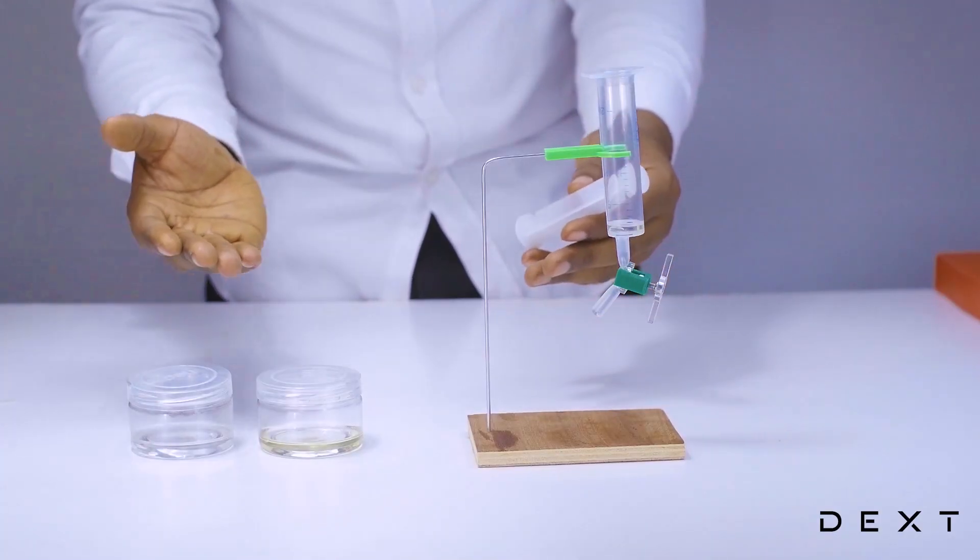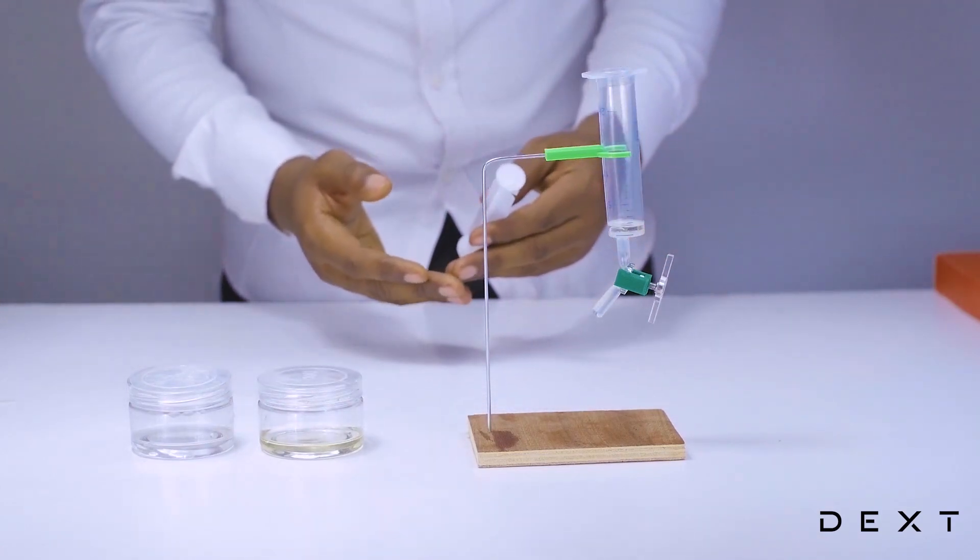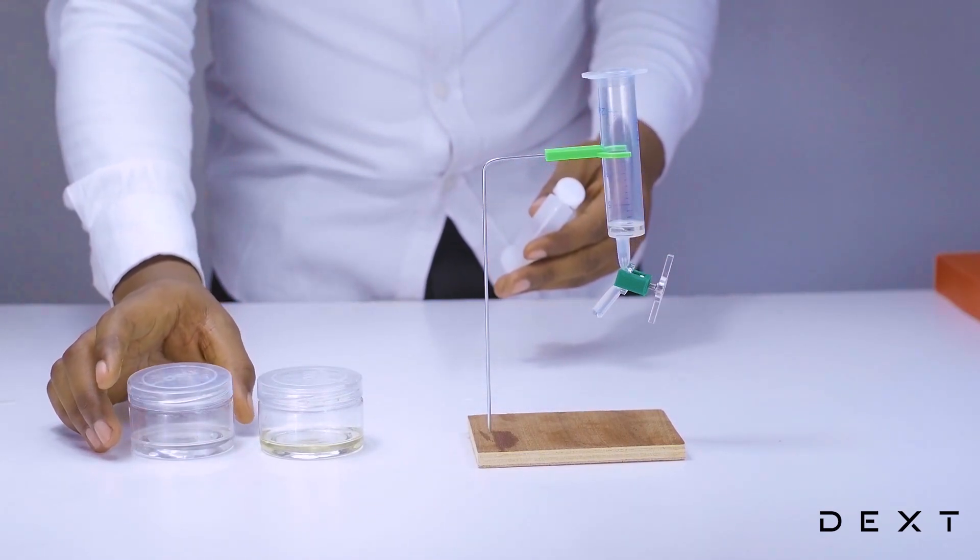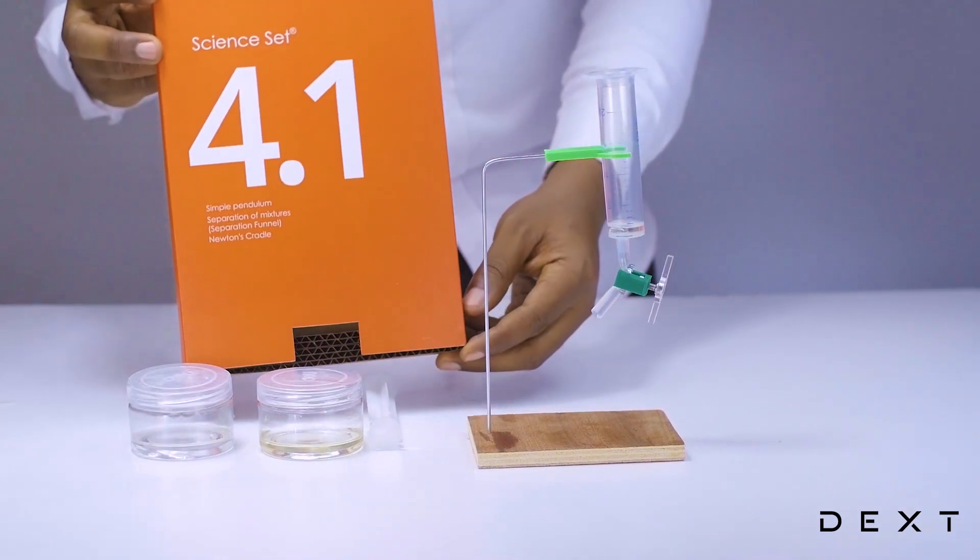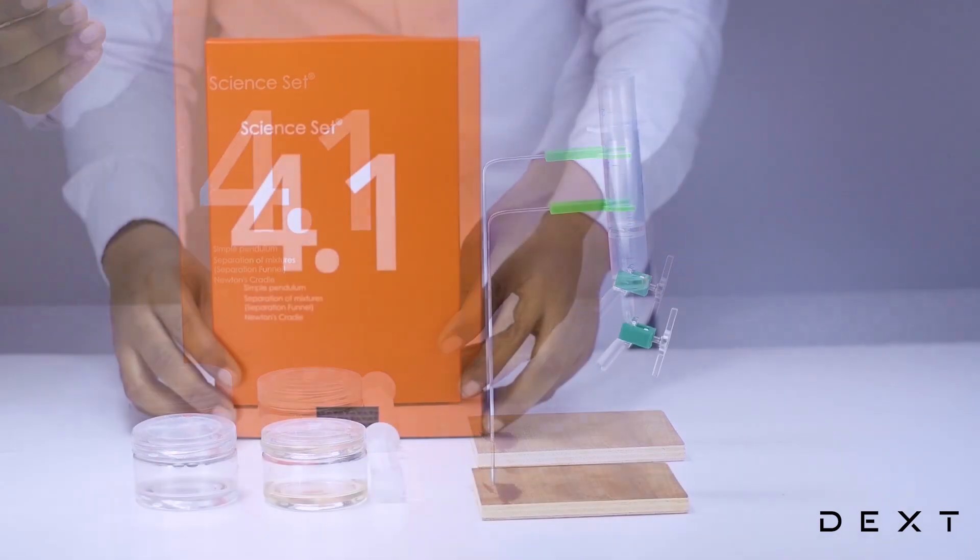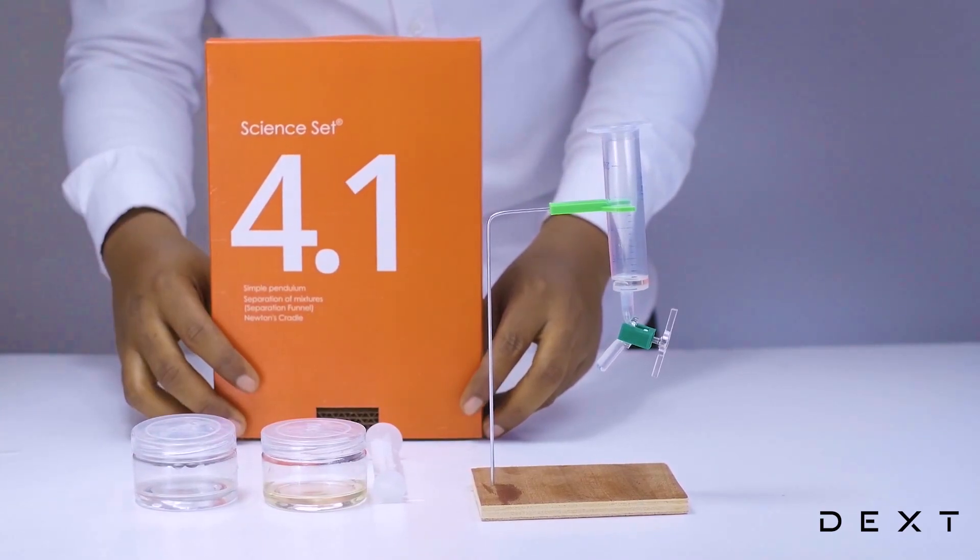They were first mixed together, but using our separating funnel, we have been able to nicely separate them back into the component. As always, this has been the tutorial using the Dext Science Set 4.1.